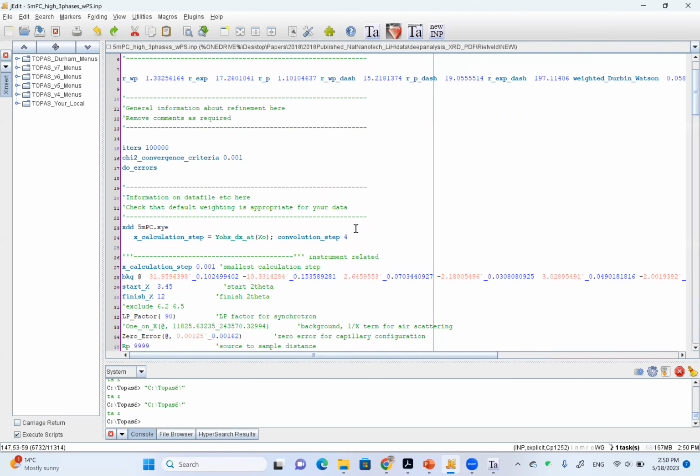We talked about the choice of sequences, right? So the sequences, well, first you should gather a template either from me or from other people who have done refinement on the interface samples. That will save you a lot of time. By a lot, I mean days.